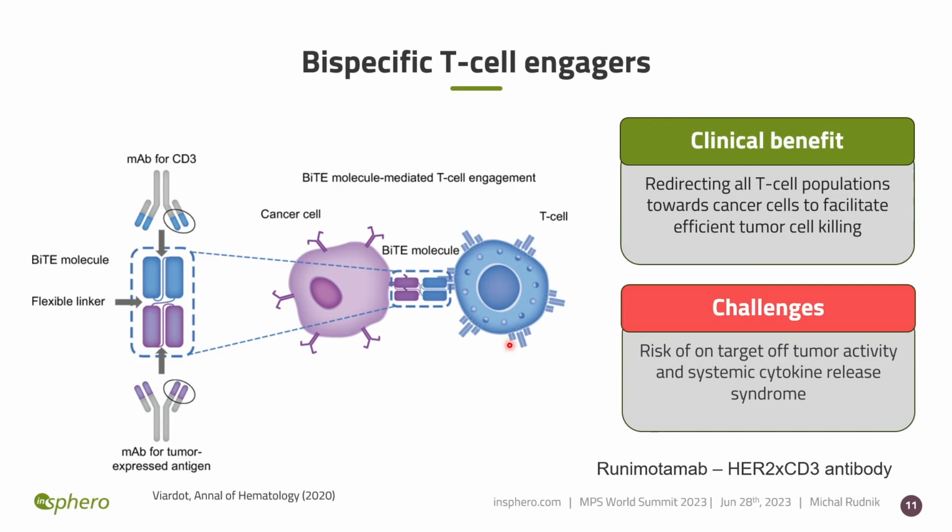An obvious clinical benefit of this technology is creating very potent therapeutic molecules, but with an increased risk of on-target but off-tumor activity and systemic cytokine release syndrome leading to organ failure. And this feature made the BiTE molecule an ideal model for our system.